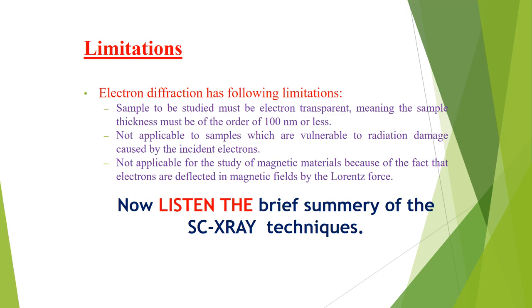Second is thin film XRD analysis. It uses grazing incidence to reduce substrate diffraction. And in the case of single crystal XRD analysis, only large crystallites are used.